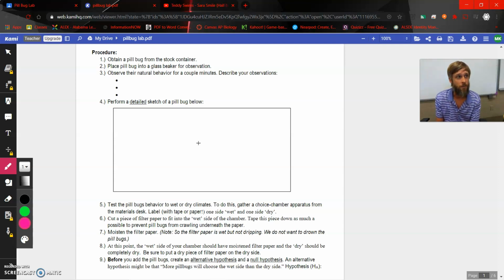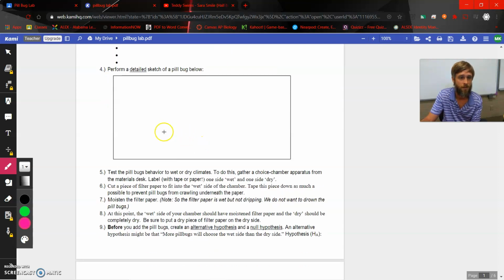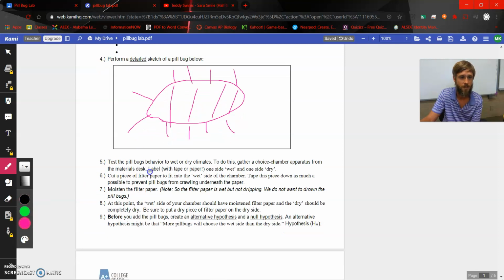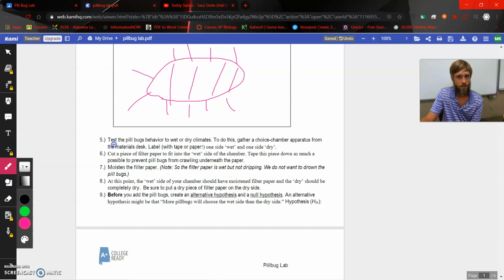It would show you what base level drawings would look like, and so you could strive to do better than that. But I'm not going to take the time to do that. Look at that. That there is a PillBug, ladies and gentlemen. That's what they look like exactly. They're even pink.